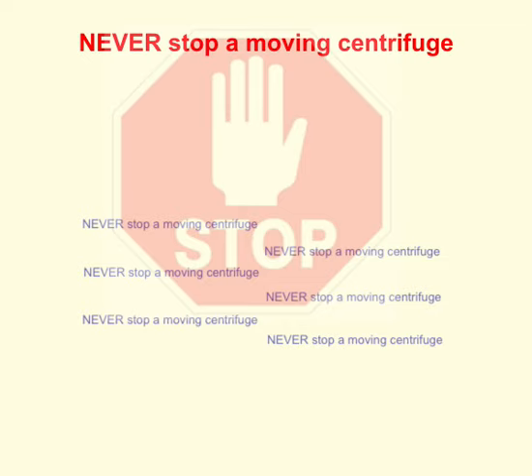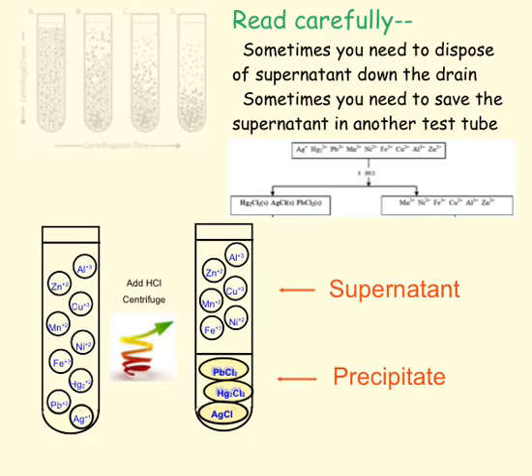Occasionally breakage does occur in the centrifuge. If that occurs, there are some ways that we can maybe salvage some of the solution out of the inserts. There are the little plastic inserts inside of the centrifuge that we can maybe salvage some of that solution out of. So your teacher can help you with that.